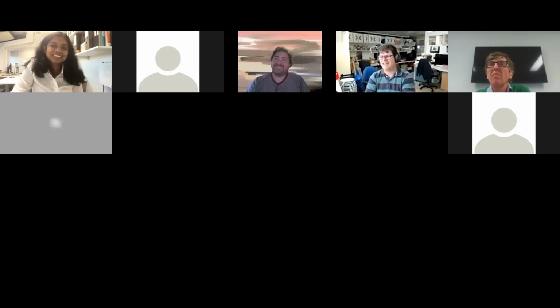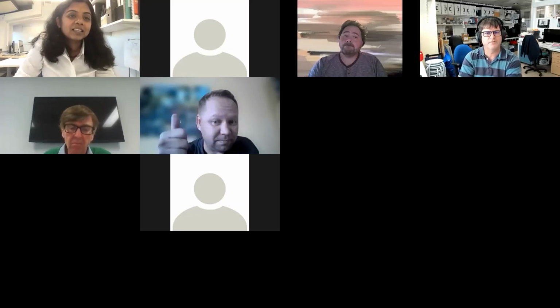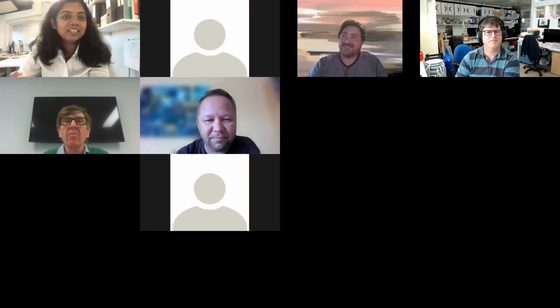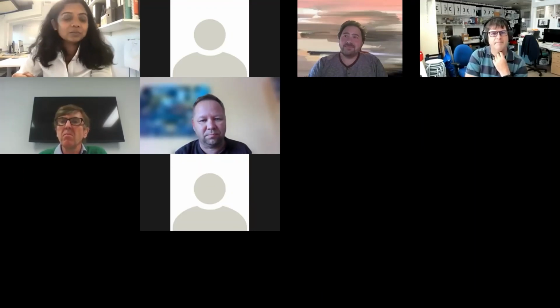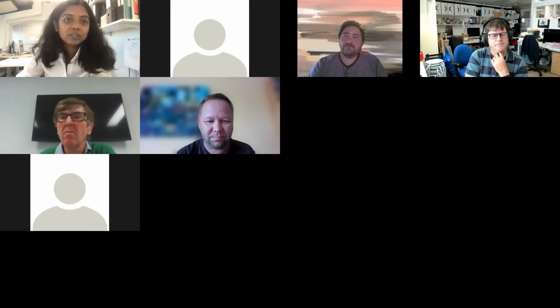Thank you. Excellent. Does anyone else have any questions for Viji? So, on the electronic tunable lenses, have you tried looking at deconvolution and setting up different variables for different adjustments of the lens? That's what we are starting, Alex. But it's not so easy, because you have to get the drivers to smoothly talk with the microscope driving software, and they are all kind of closed. So we're trying to use Micromanager to somehow reach the microscope controller. So we have just started.